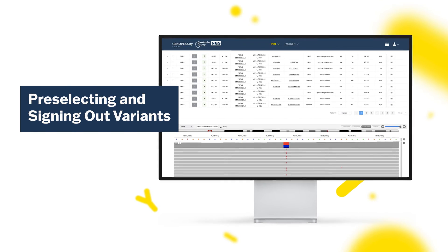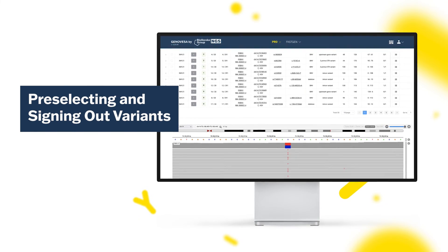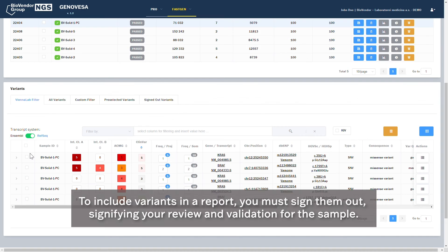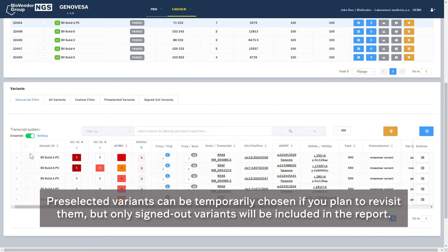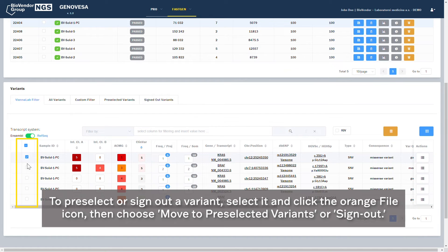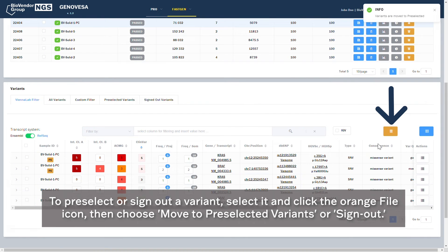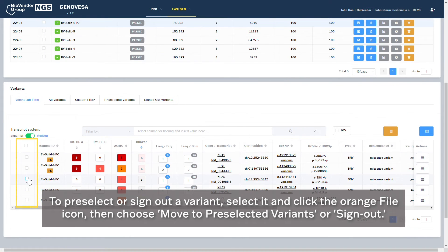Pre-selecting and Signing Out Variants. To include variants in a report, you must sign them out, signifying your review and validation for the sample. Pre-selected variants can be temporarily chosen if you plan to revisit them, but only signed out variants will be included in the report. To pre-select or sign out a variant, select it and click the orange file icon, then choose Move to Pre-selected Variants or Sign Out.